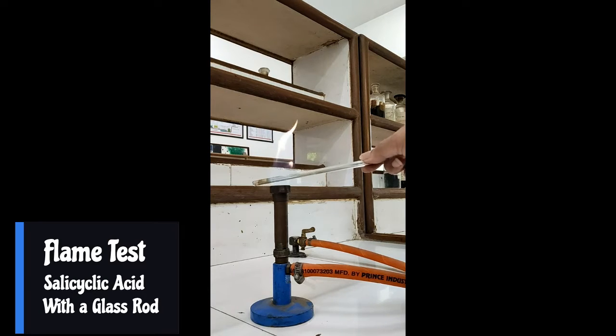Take the compound on a glass rod and observe how it reacts with the flame. It gets burnt - observe whether it produces a white flame or a black flame.